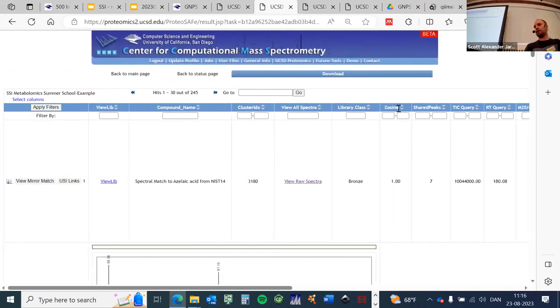We didn't generate it, but at the very beginning, when you submit a job under advanced library options, there is the question whether you want to perform analog search, and you can turn this on and off. By default, it's turned off because it's a little risky to give this to new users, because they will think it contains all these molecules, but they actually have larger mass offsets and something completely else. But for advanced users, I strongly encourage you to play around with it. I really like using this. It boosts the annotation rate tremendously, but then those are all level 3 or level 4 annotations.